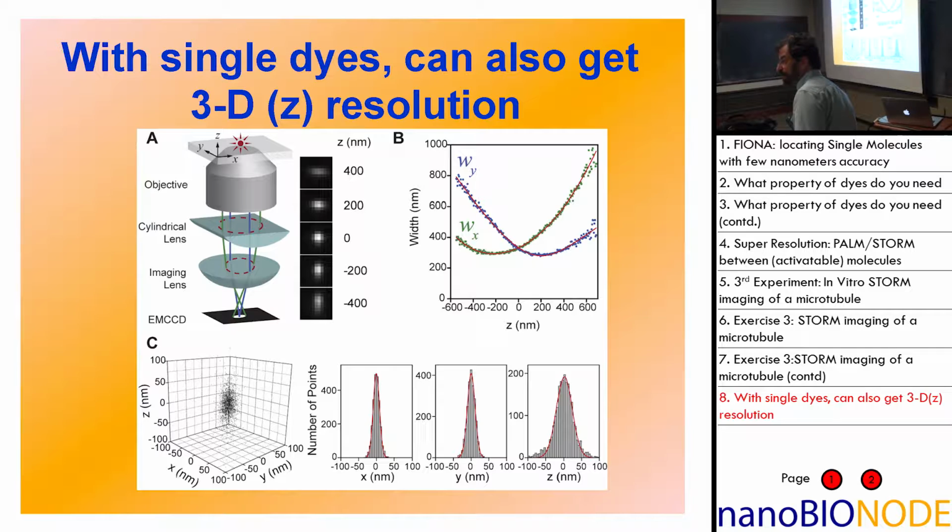Right, exactly. How do you get the XY direction in the Z direction from where you are? And then perfect focus, so you use your perfect focus as a reference point to see how it changes with incoming focus.